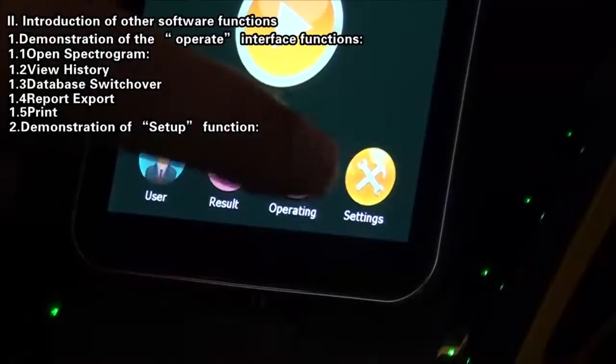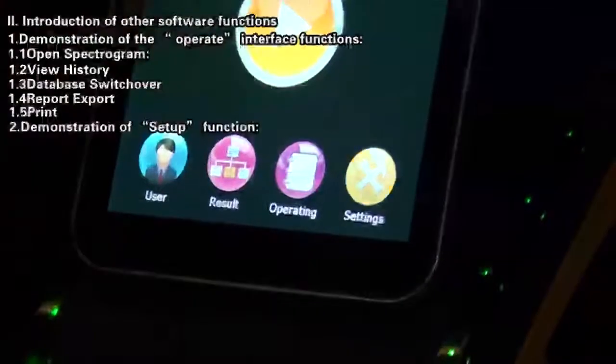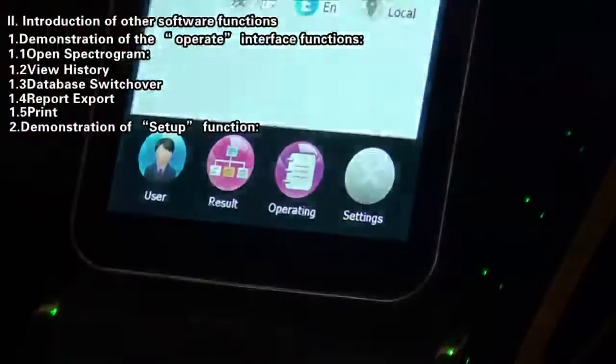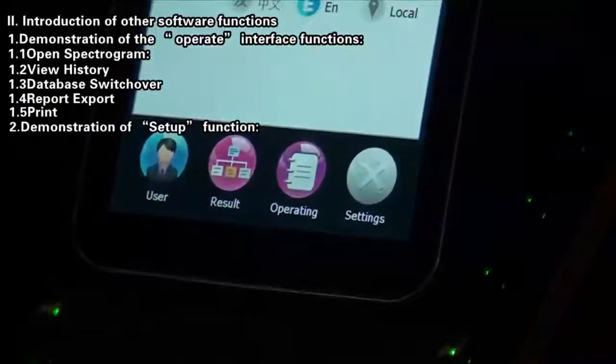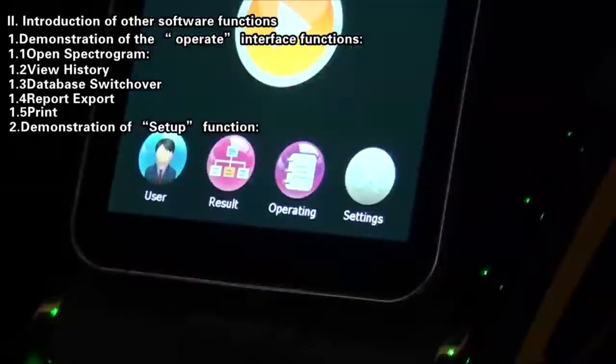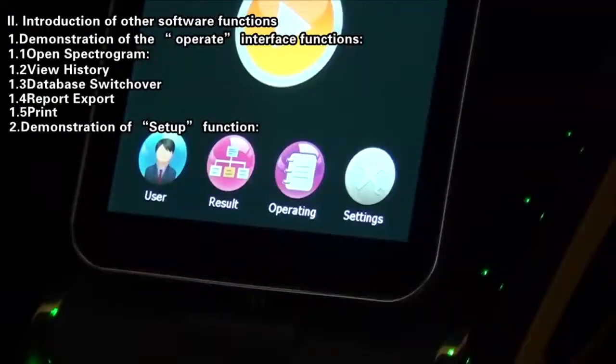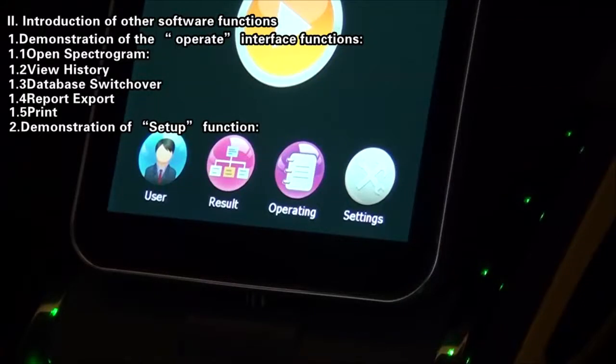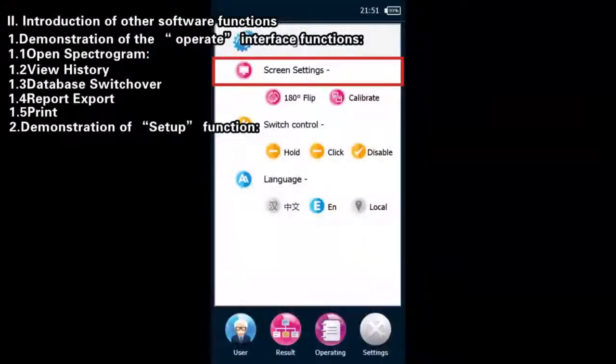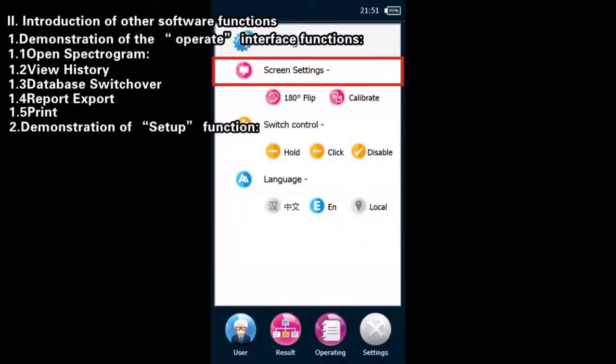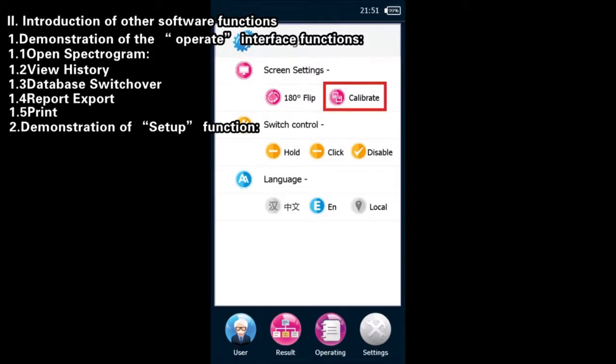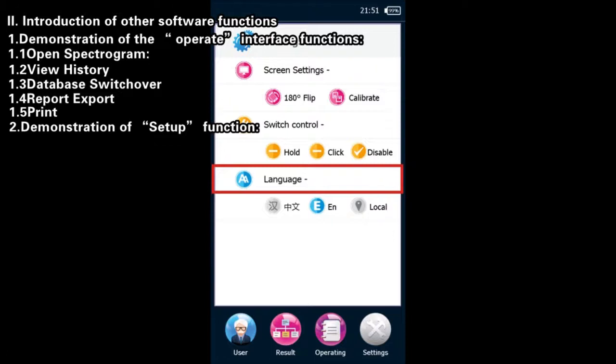Demonstration of Setup Function: On the main interface, click the Setup button to access the interface of setting up the system. On this interface, it is allowable to carry out the setup of screen rotation, screen calibration, mode of trigger pulling, and software language.